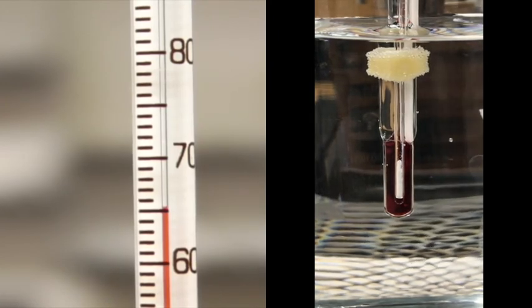Pushing above 65, so let's keep an eye on those crystals. You'll start seeing some moisture form when it first starts to melt, and you want that temperature when you first start seeing some moisture in there.